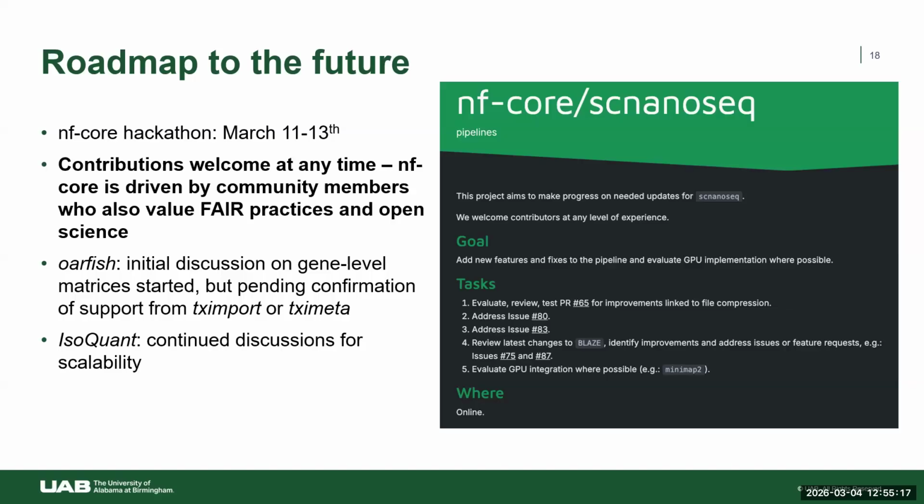But beyond the NF Core Hackathon, again, oarfish, I love oarfish because it's very fast, but really I would love to have a standardized approach to also summarize that data into gene level matrices, just to make life easier for the users. And I already started this discussion with Dr. Michael Love, who is the creator, developer of DESeq2, tximeta, tximport, because that's something that those tools should be able to support. But again, if we cannot go down that direction, I do have a few ideas as well on how to properly summarize this data, but we have to very cautiously validate it as well.